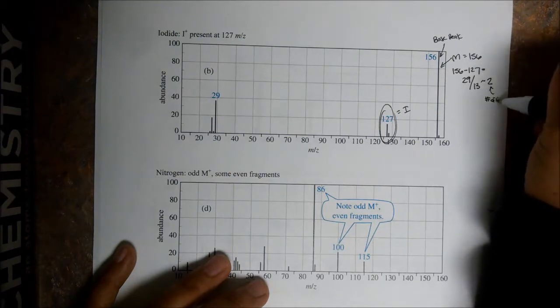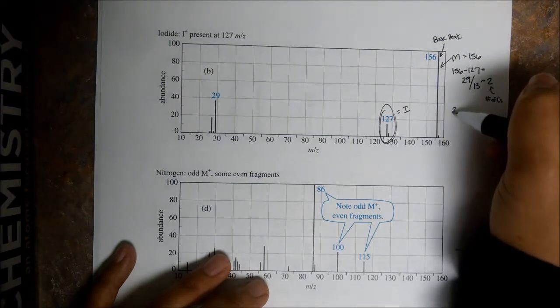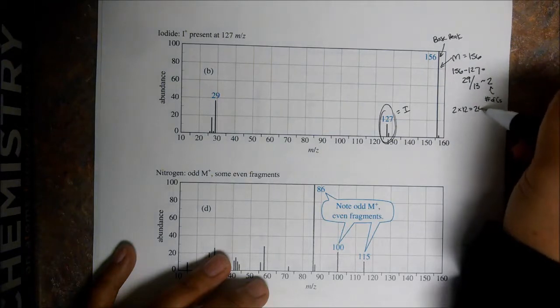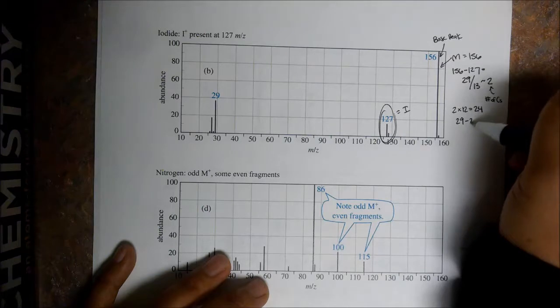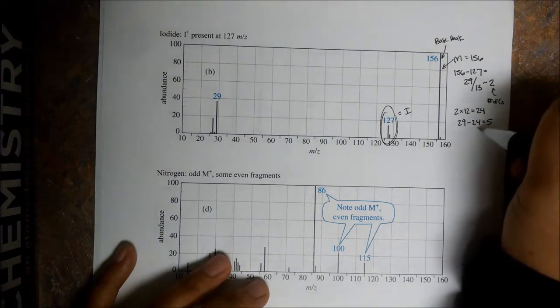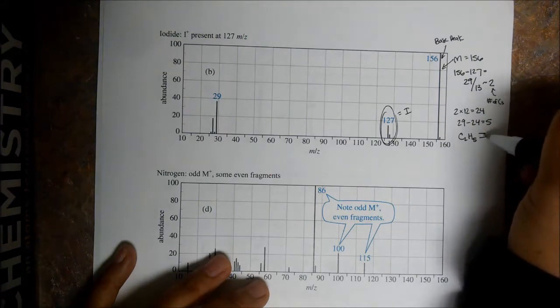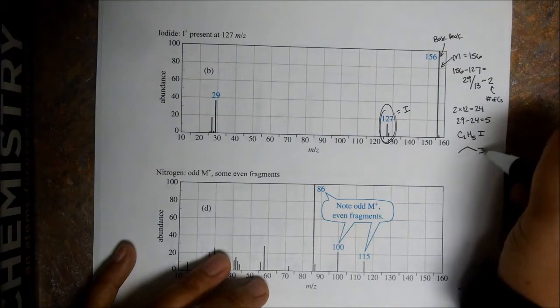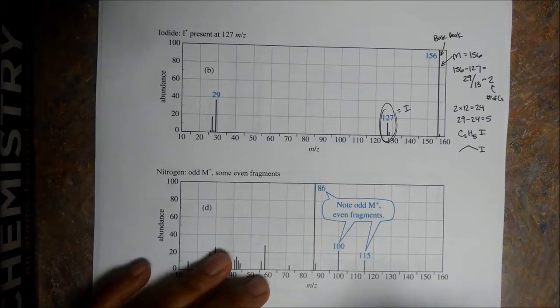Let's use this number of C's to see how many mass units we have left. 2 times 12 equals 24. We had 29 left to begin with, and 29 minus 24 gives 5. So this could correspond to C2H5I. What could this structure be? Really simply, there we go: 2 carbons, 5 H's, and iodide.